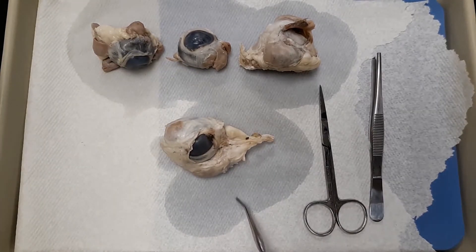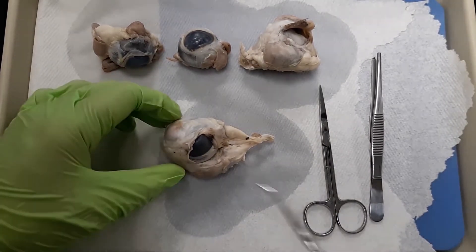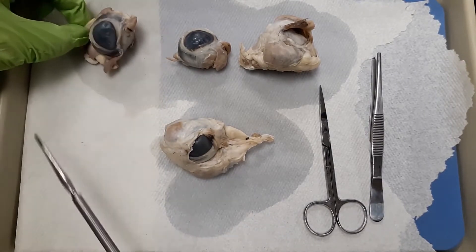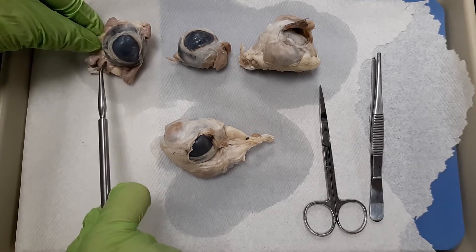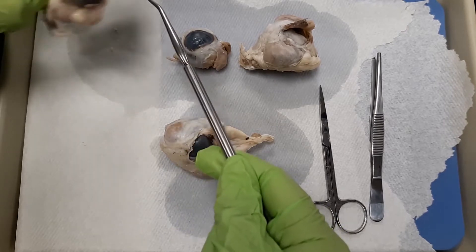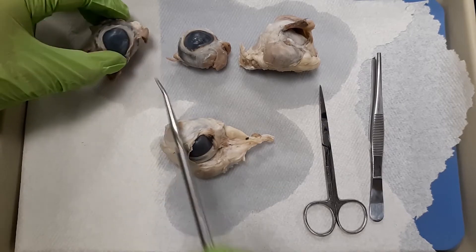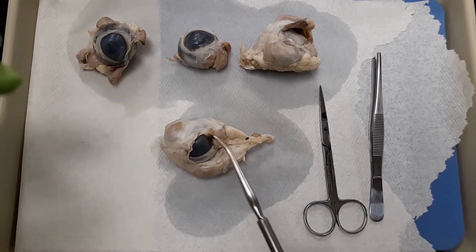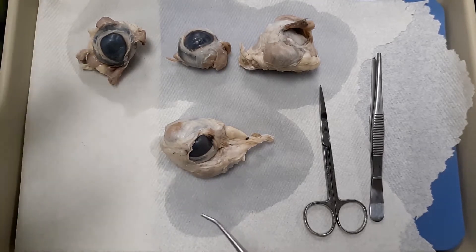One of the important structures you need to know — starting with the external portions — you're going to see muscles on the outside. Note that the human eye has six extrinsic muscles, but we only see four on the sheep. These muscles help the eye move up, down, left, and right. In our eye, they allow us to look left and right without having to turn our head, rotating the eye laterally or medially.